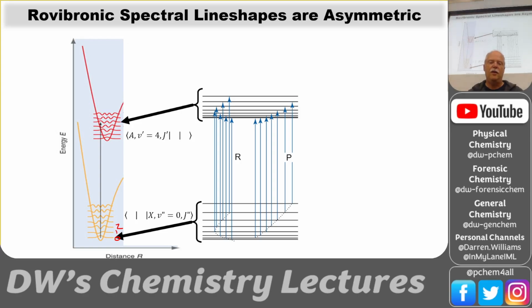rotational lines, what I've drawn here with these rotational lines, is I'm showing that if we were to plot the spectrum down here, each of these little peaks, so if this is, let's see, how is this written? We'll say this is high wave number, yeah.